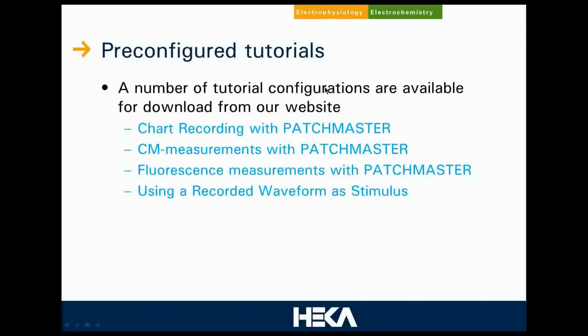And let people know that there are pre-configured tutorials on our website. Basically, they have all the files for the configuration, for the online analysis, and for the PGF for a variety of different tutorials. We have a chart recording with Patchmaster. It's more enhanced than what I've shown. Capacitance measurements, fluorescent measurements, and also using a recorded waveform of stimulus.